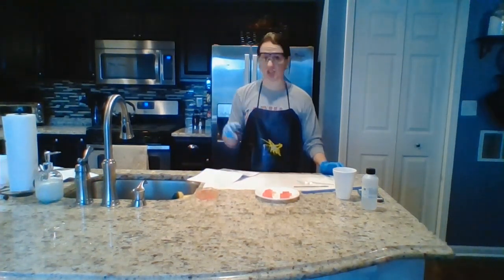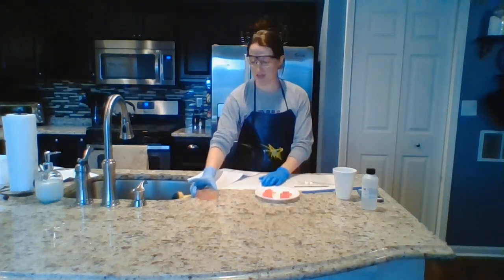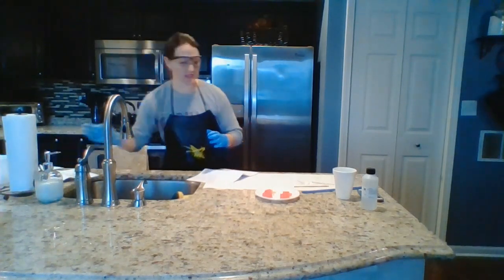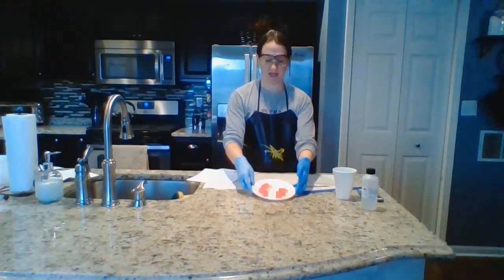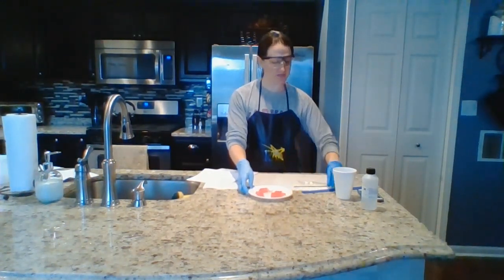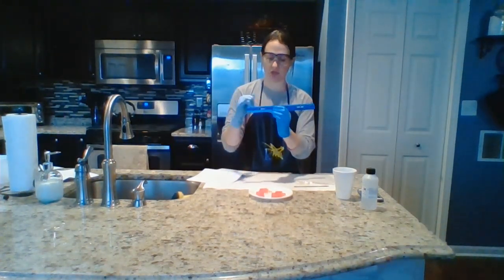Right, we are back here in part 1 and 2 after we did our advanced prep for our agar cubes. So here's my agar, it's all set and ready to go, and I've already taken it out of its plastic container and put it onto a plate and cut it up into 1, 2, and 2.5 centimeter cubes using my ruler. Remember, centimeters is the smaller part of the ruler, not the larger one.